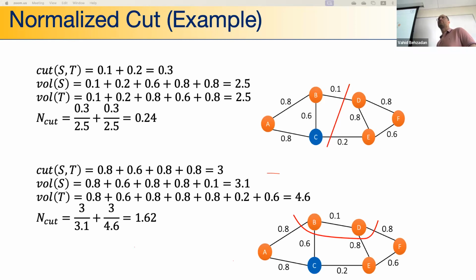Yeah, that's fine. So my question is about the closeness, 0.1, 0.3. This is built on that. You come up with a number of descriptors. You call them features to represent each cell. In here, the features are gene expression. Is that right? Yeah, exactly. And from that distribution here, you have one cell connected to 2 cells and one cell connected to 3 cells.